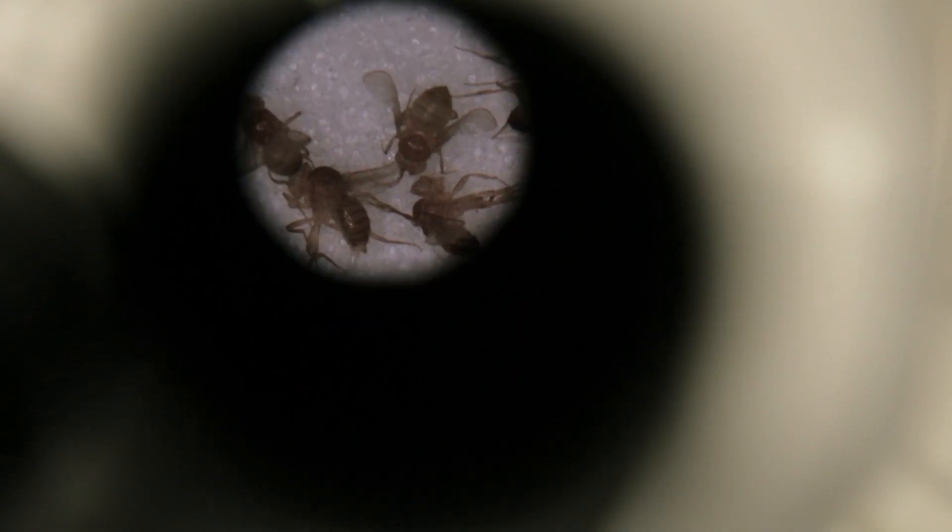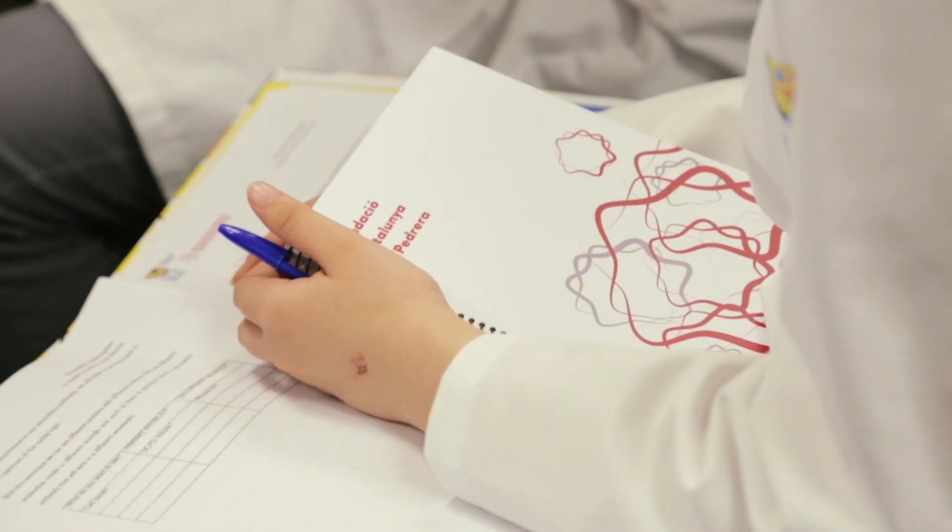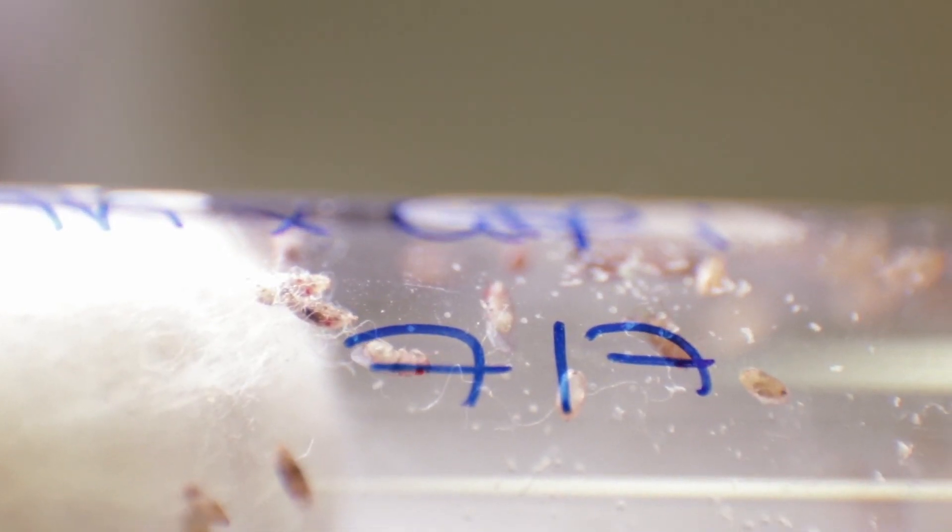The main purpose of this project is to introduce Drosophila melanogaster as a very good model to study human diseases. One of the best things about the BISC project is that you learn by doing with the real machines, with the real protocols that we use in the lab.